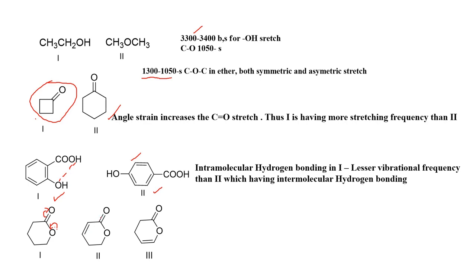While this molecule also has an oxygen containing a lone pair of electrons, this also contributes to the delocalization. Here there is a pi bond. This also contributes to delocalization, and hence conjugation on either side of this carbonyl group.